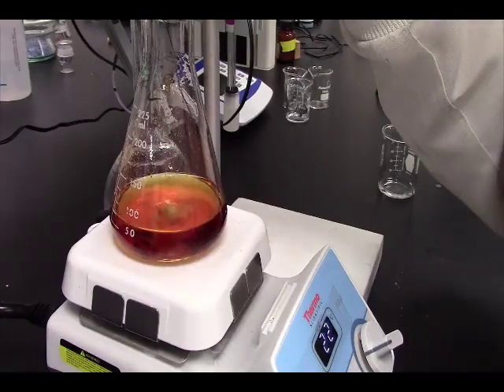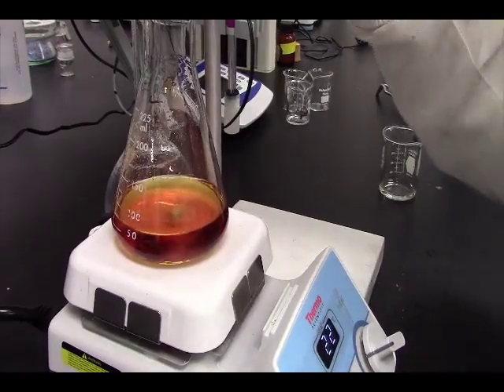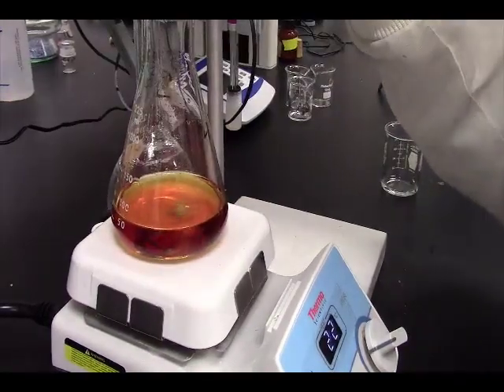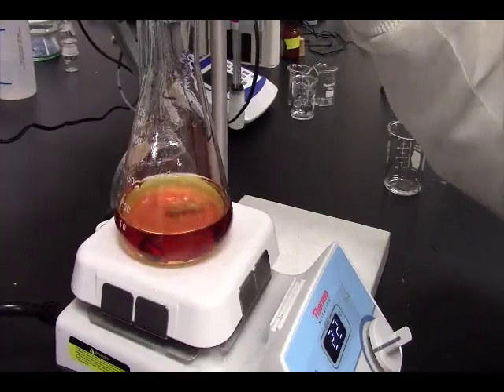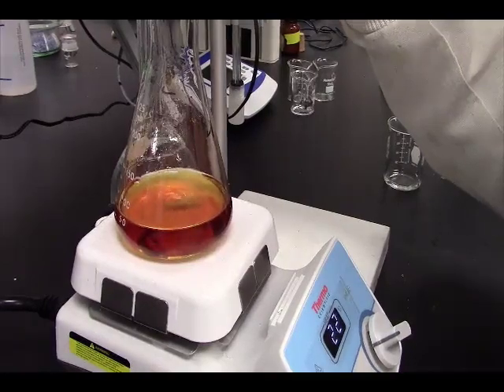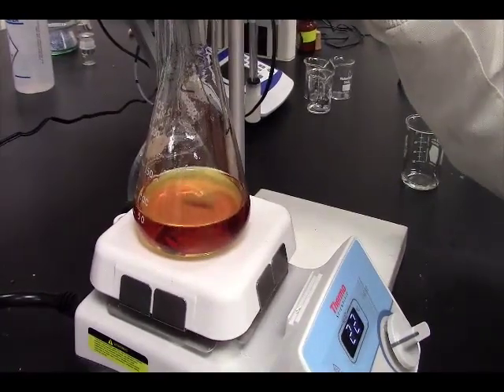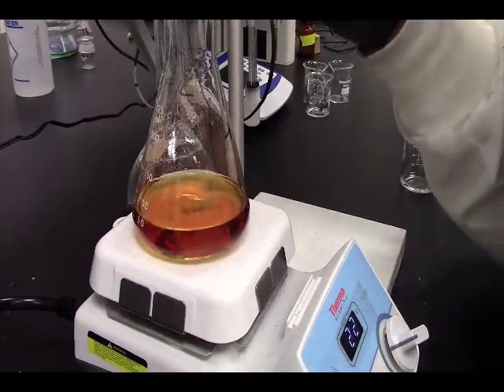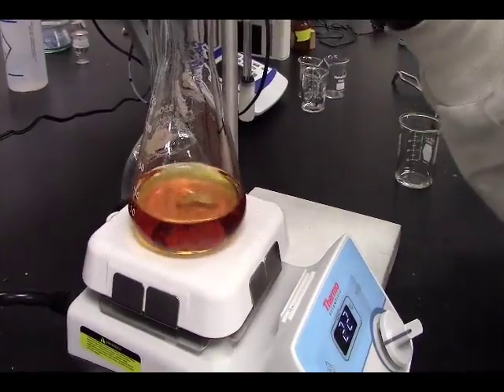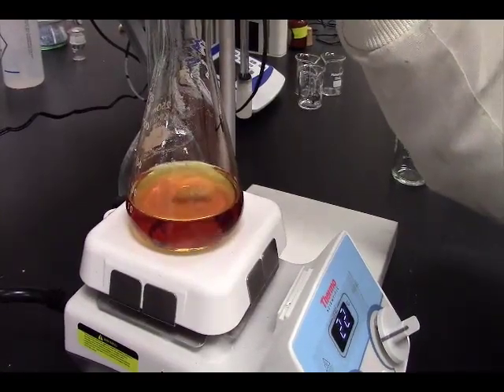Still a little bit orange. My orange is going away. I've got a drop there that I need to pull in. Much lighter, huh? Let's see. That's pretty much a straw color. It's a yellow, but it's got a slight orange cast. That's a straw color. Maybe another drop or two. Let's see what happens.